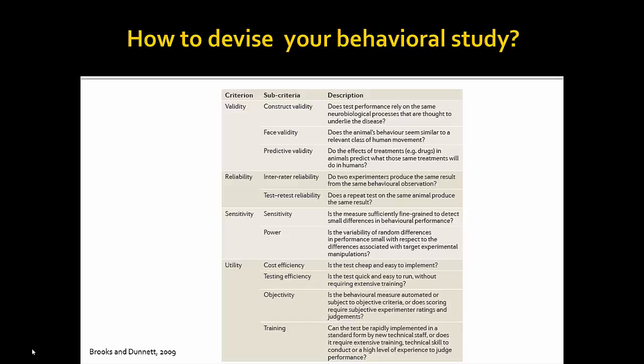If you're in a very busy area, with a lot of noise and a lot of traffic, you don't want a test where they need to move around and then freeze because they hear a thump of a door, or the elevator going off, or people talking on their cell phones. So these are other things that you need to think about.